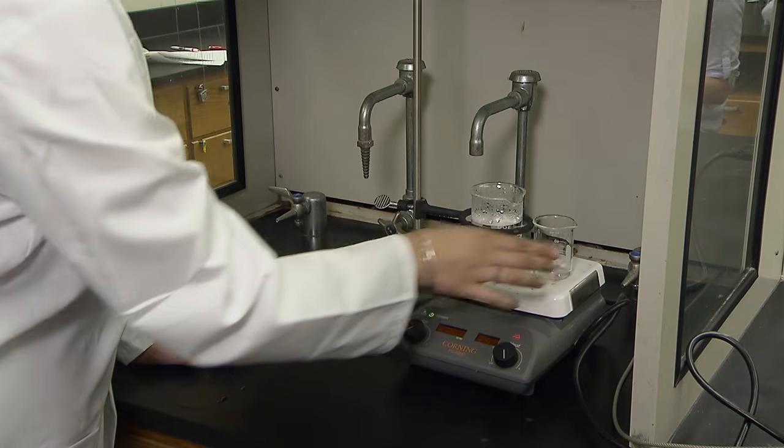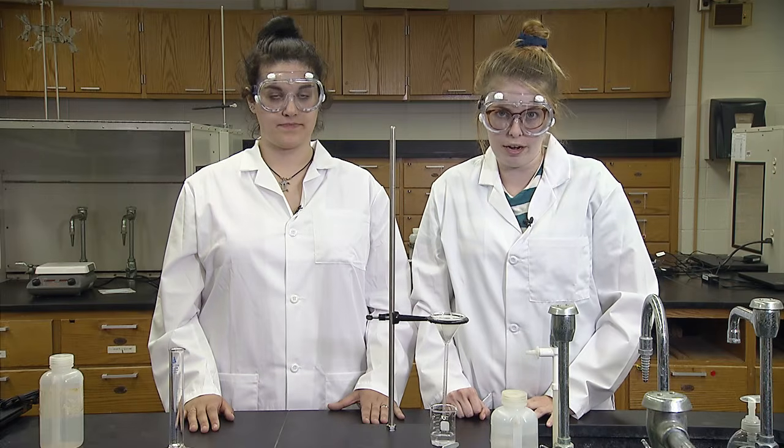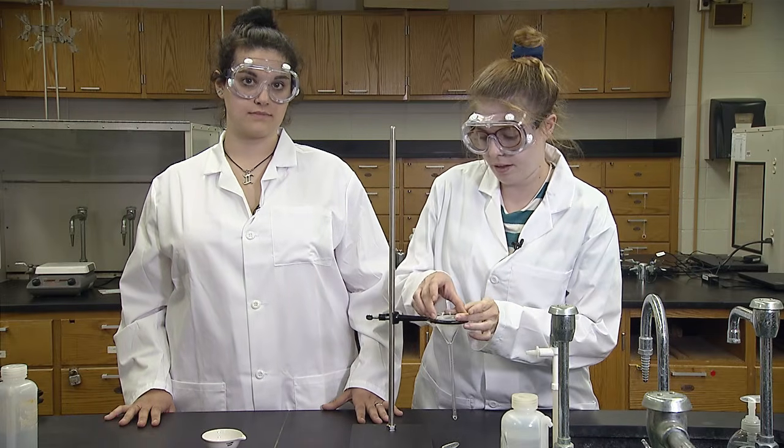Now that all the filtrate has passed through the filter paper, we can boil off the water to recover the solid salt. Wash beaker 1 to use in part 3. Keep an eye on this beaker as it boils down. When there is around 1 milliliter of solution left in the beaker, you may see solids start to crystallize on the sides. The beaker is then moved to the oven to finish drying. While beaker 2 is boiling, we move on to recover the next solid.